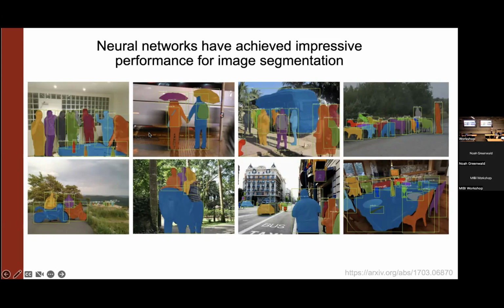There's been a huge amount of research from the computer science community on this task of segmentation, because this is so crucial for image analysis, for self-driving cars, for any application where you need to identify what the objects are in an image. These algorithms now can get really, really high accuracy, basically extremely faithfully recapitulating what the specific shape of these many different objects are in different images.